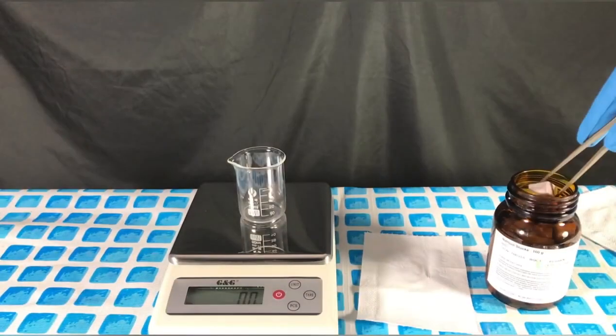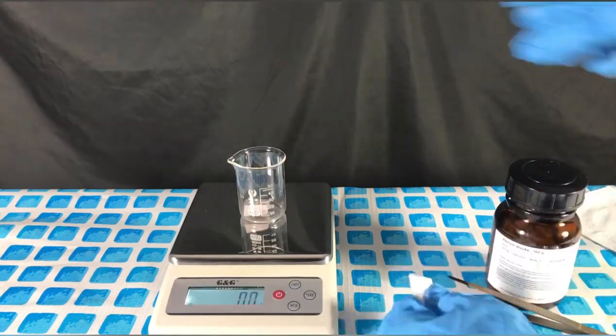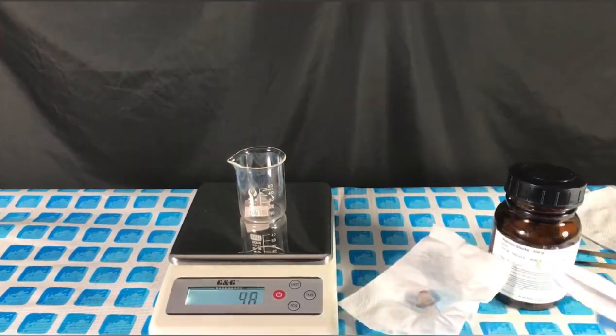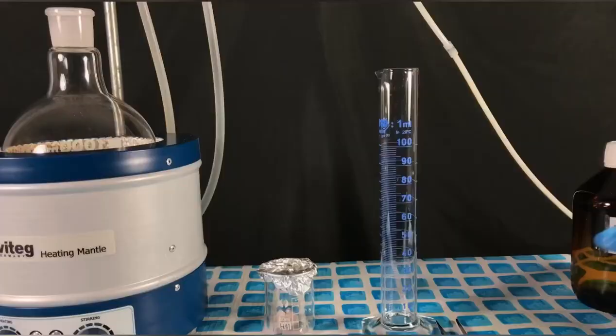We start off by weighing out 5.8 grams of sodium metal. The sodium metal was wiped dry to remove any paraffin that stuck to its surface.